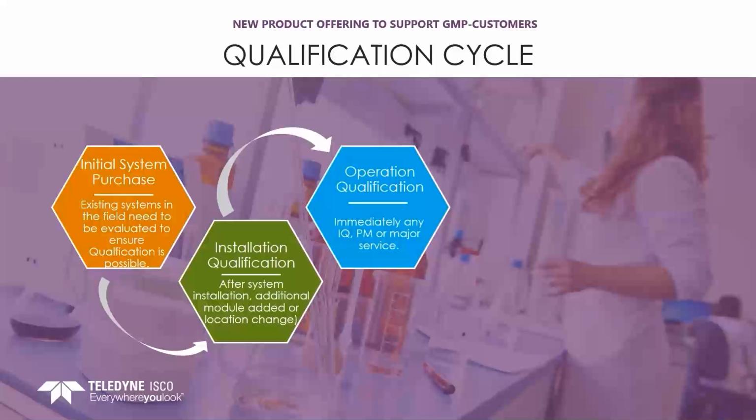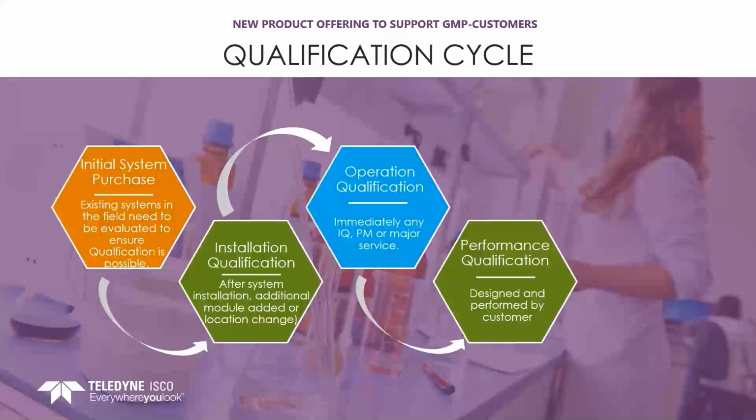This would then be immediately followed by an operation qualification, and this would follow any IQ, PM, or major service. Performance qualification is something that you, the customer, would perform, and this is specific to the process that you're working on. This is designed and performed by the customer.